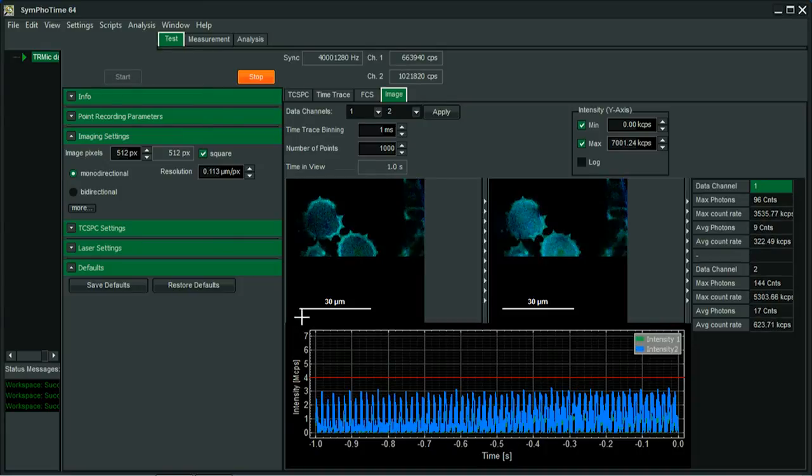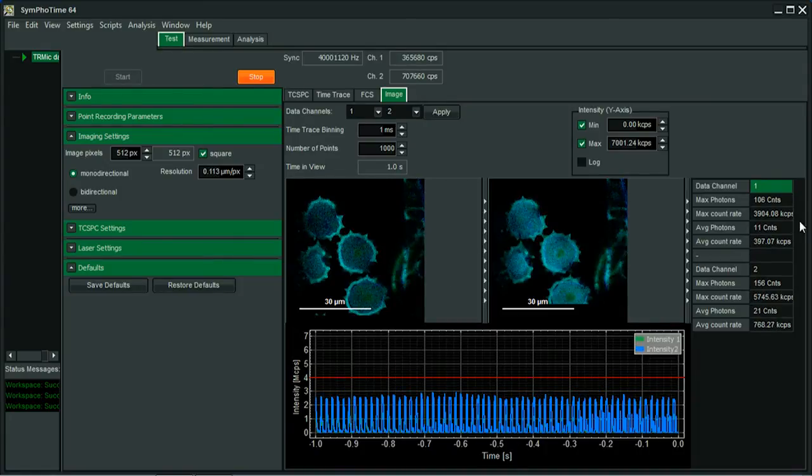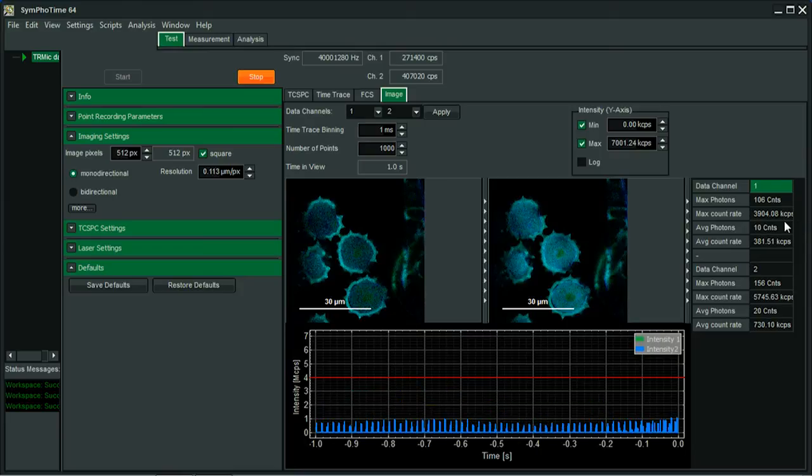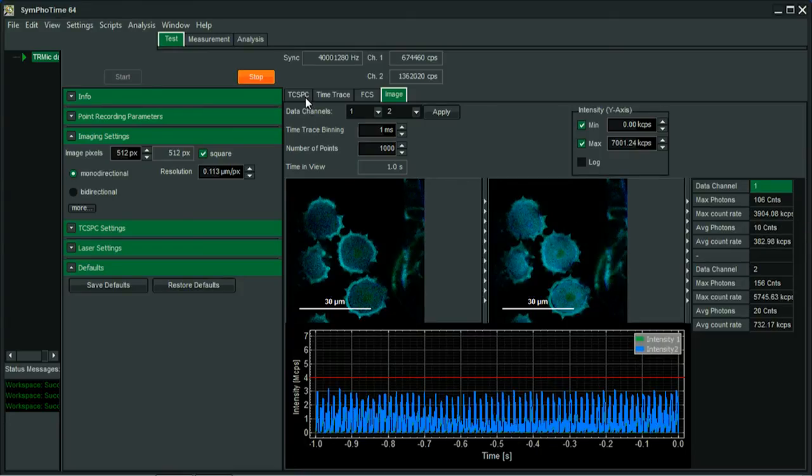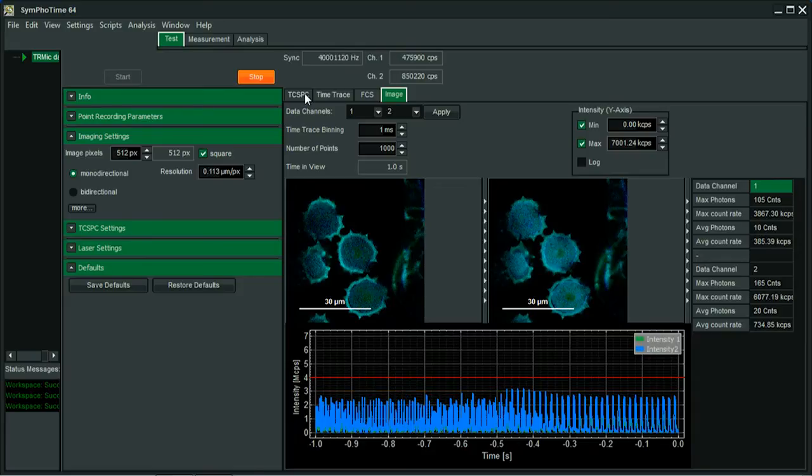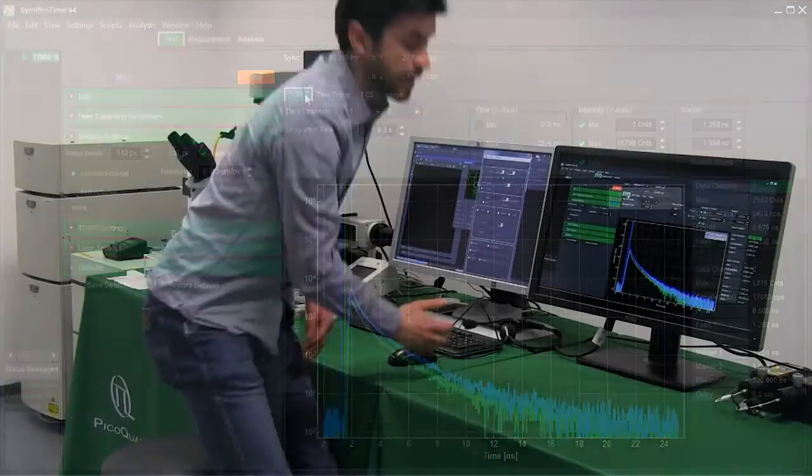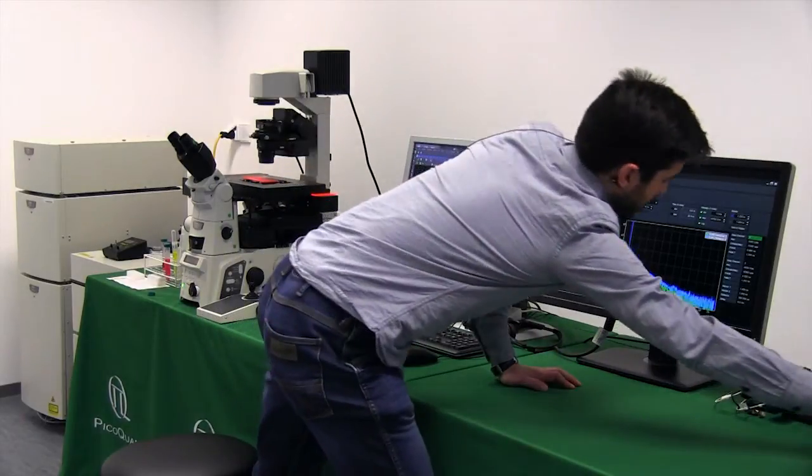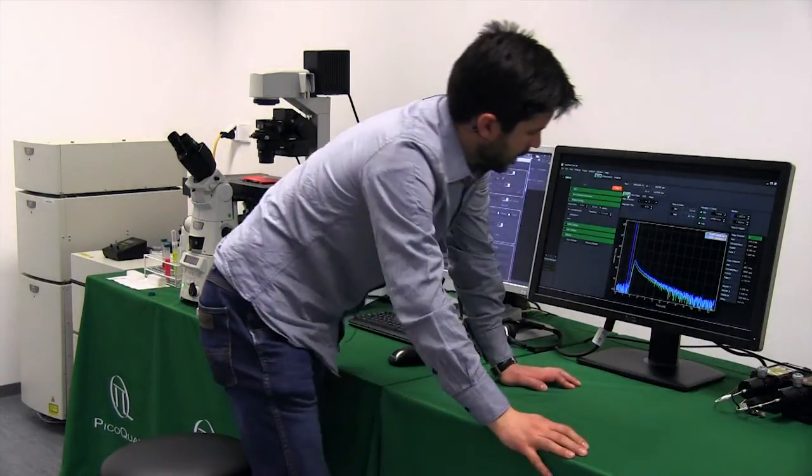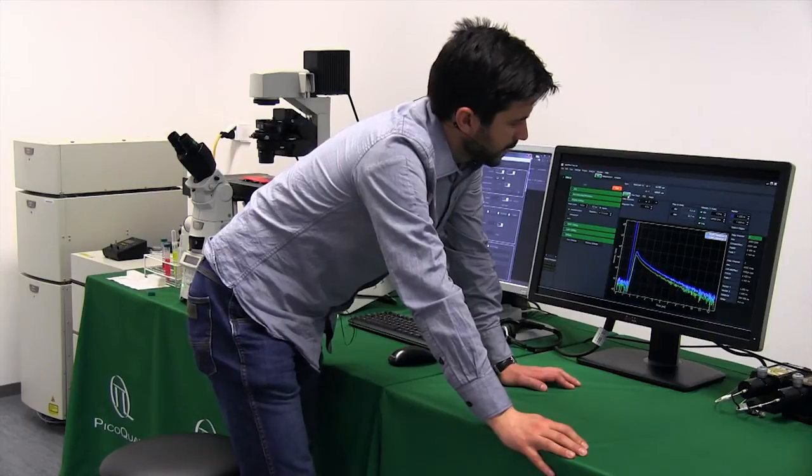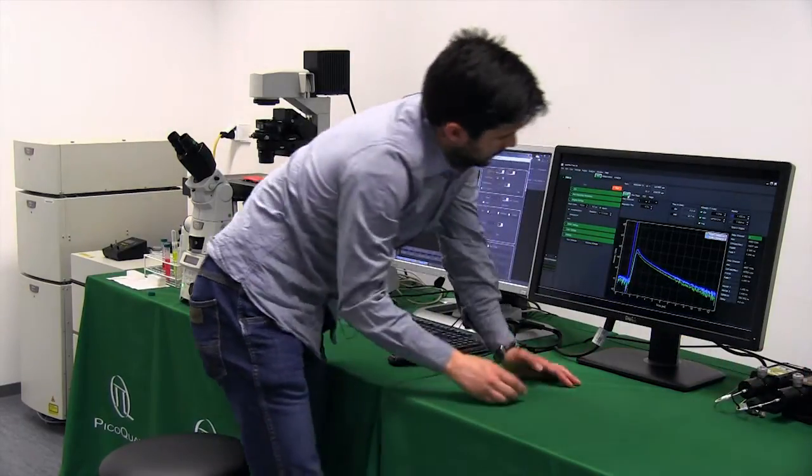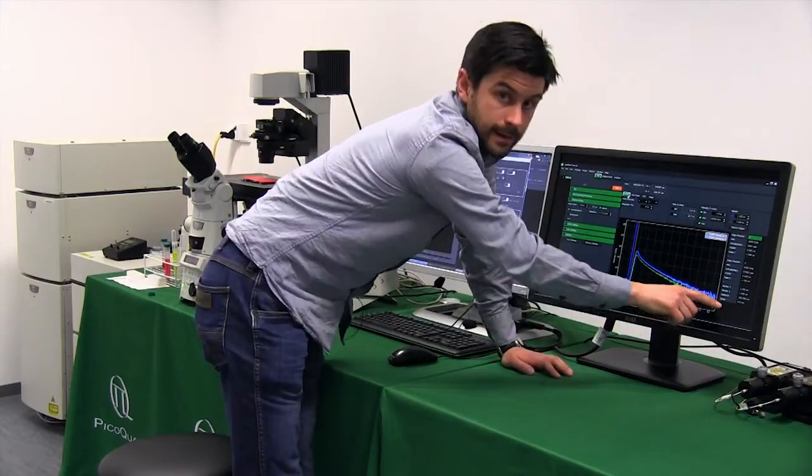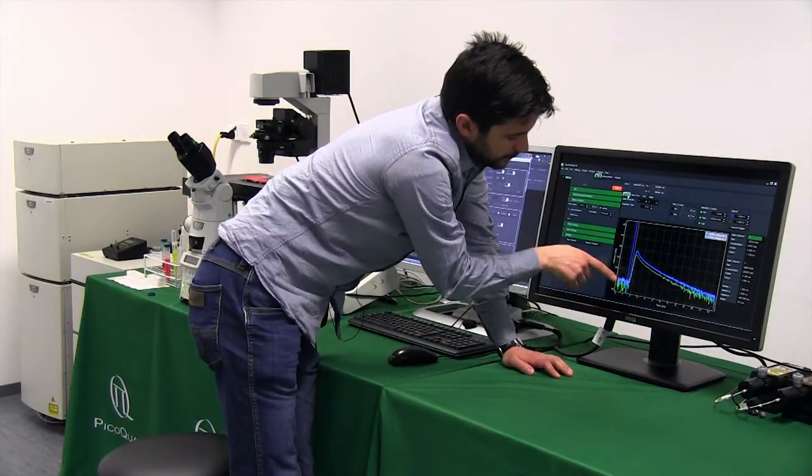In the SymPhoTime software to control the repetition rate, we can go here to the time-correlated single photon counting tab and now with the manual laser driver we can change here. So now we would have a repetition rate of 80 megahertz and we will see that this decay that is ending here actually is wrapping around here.